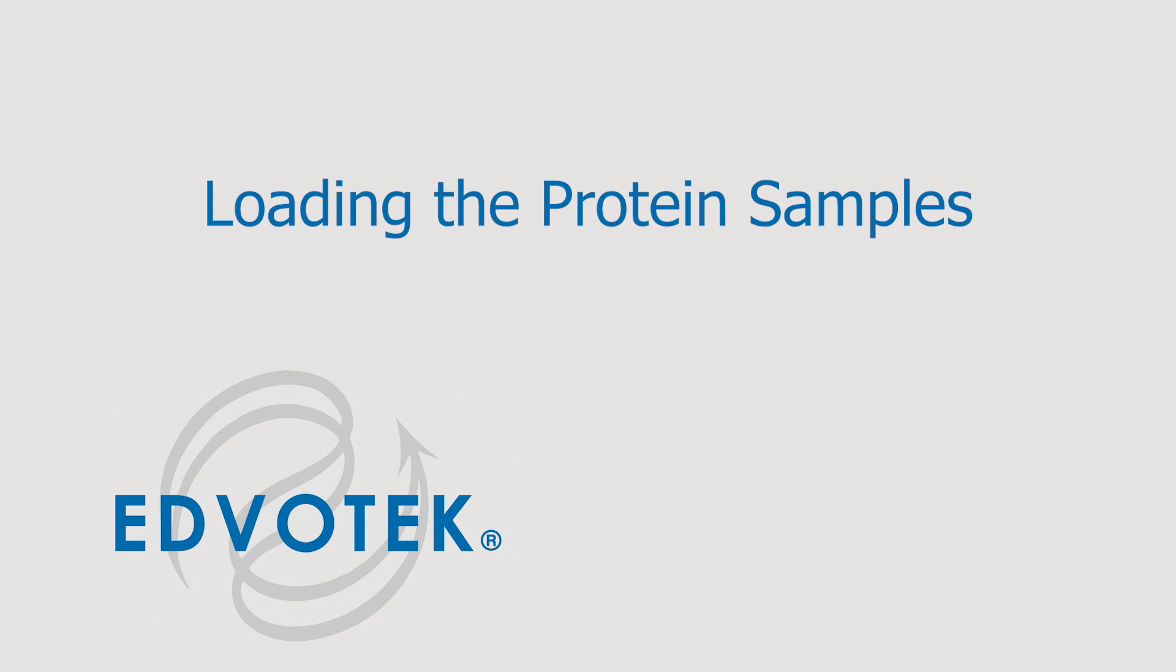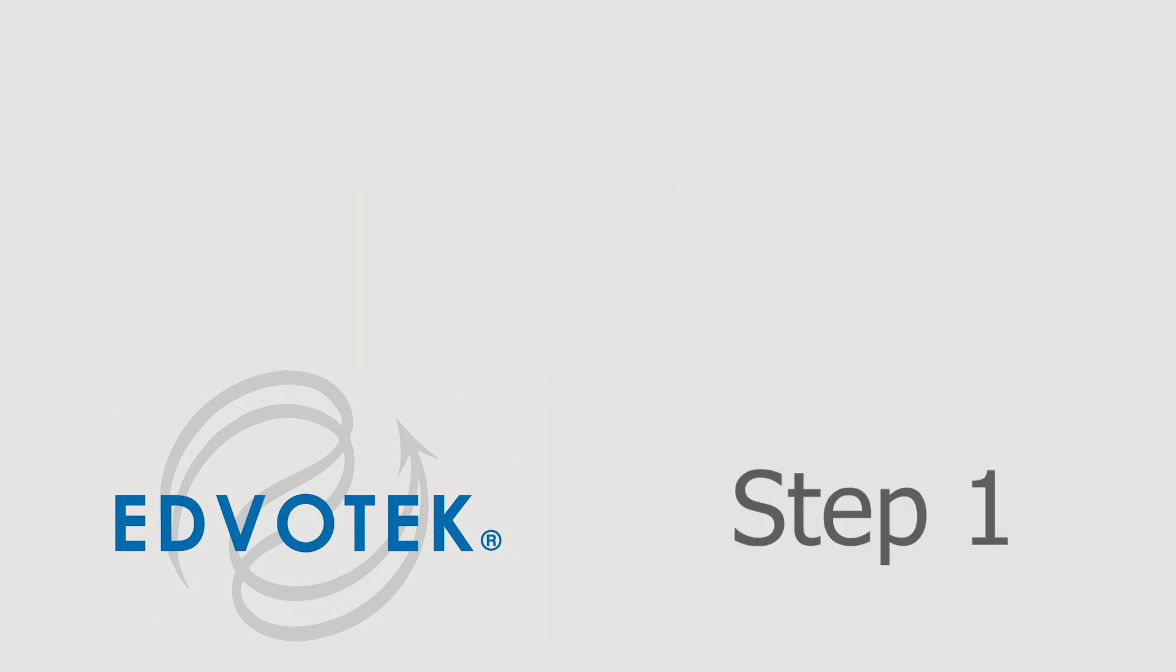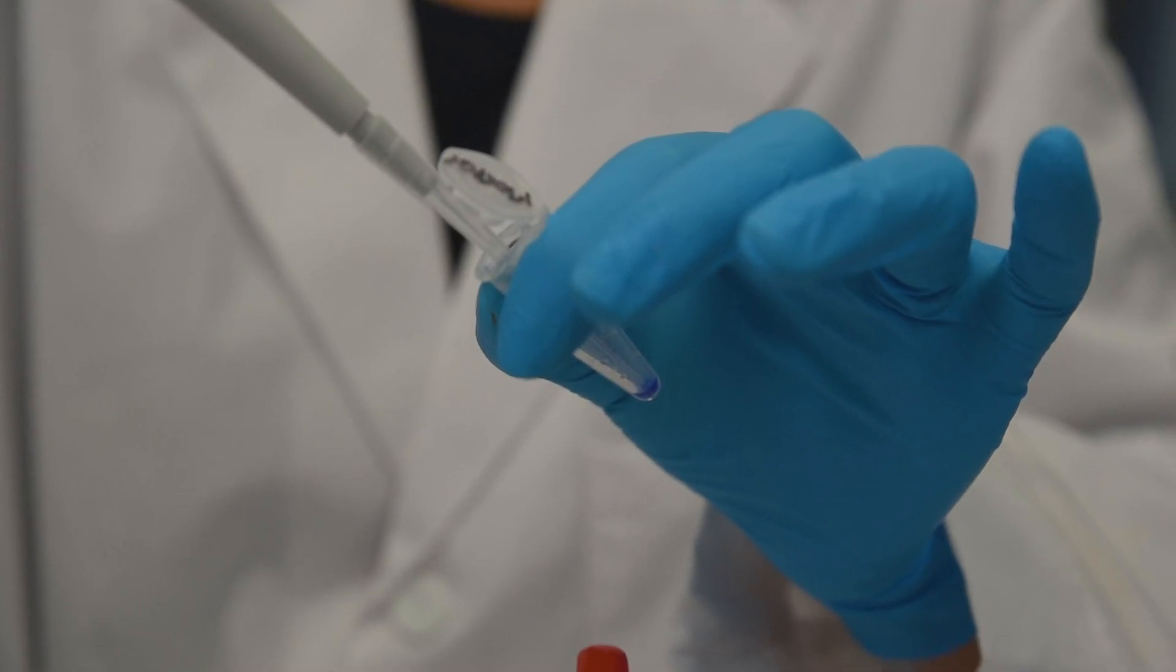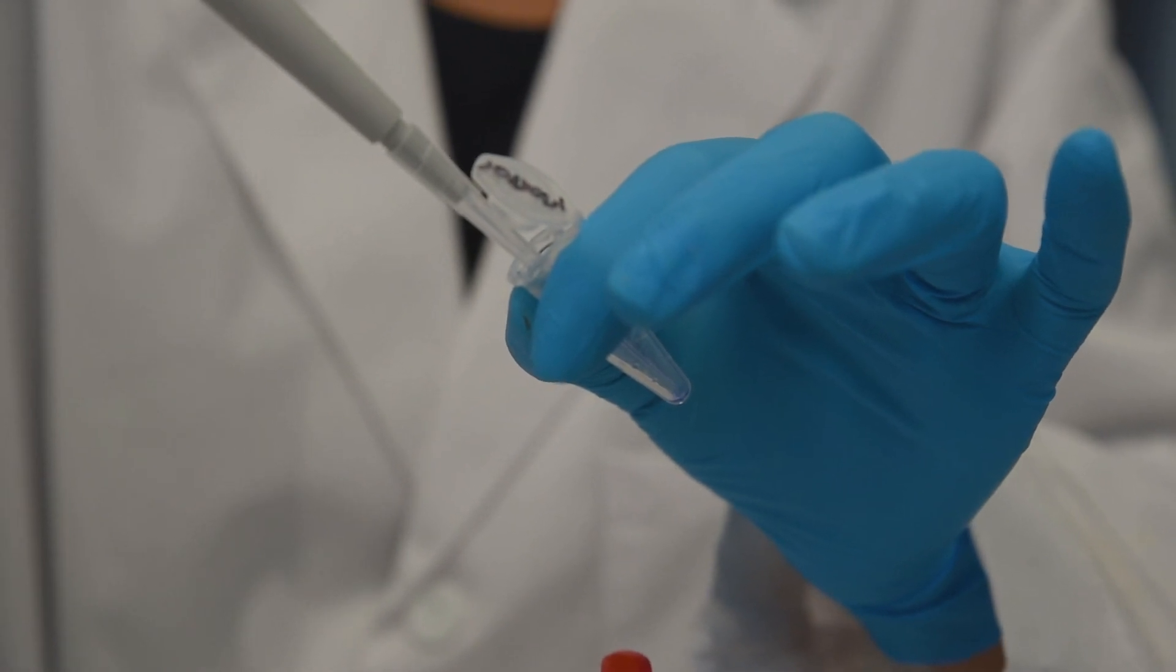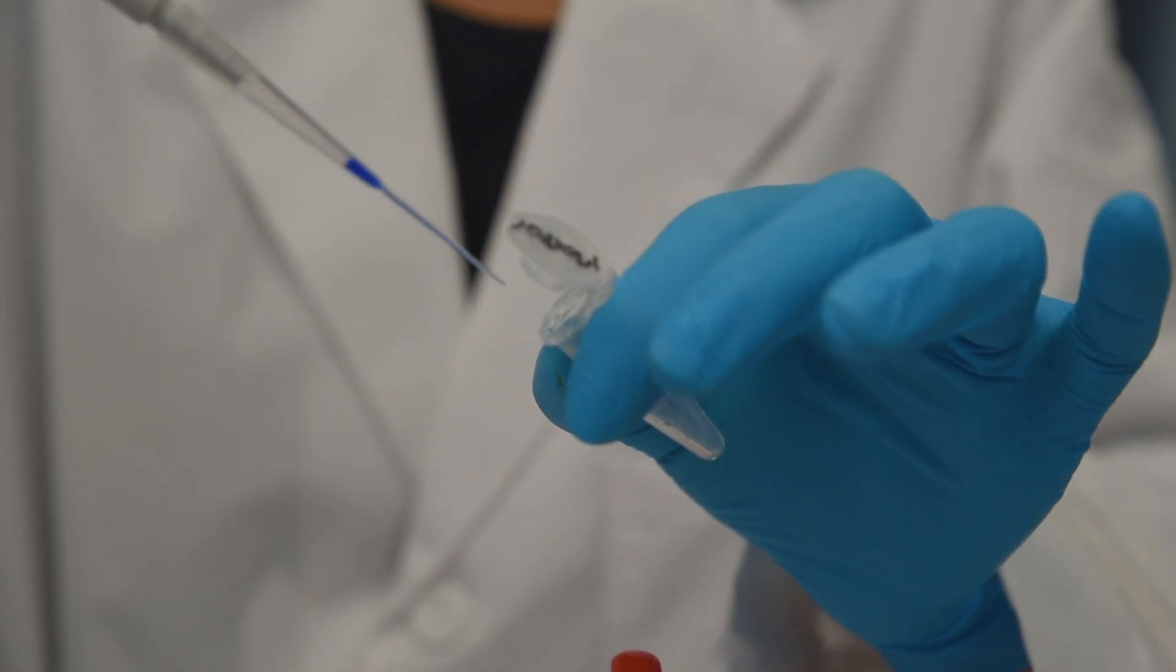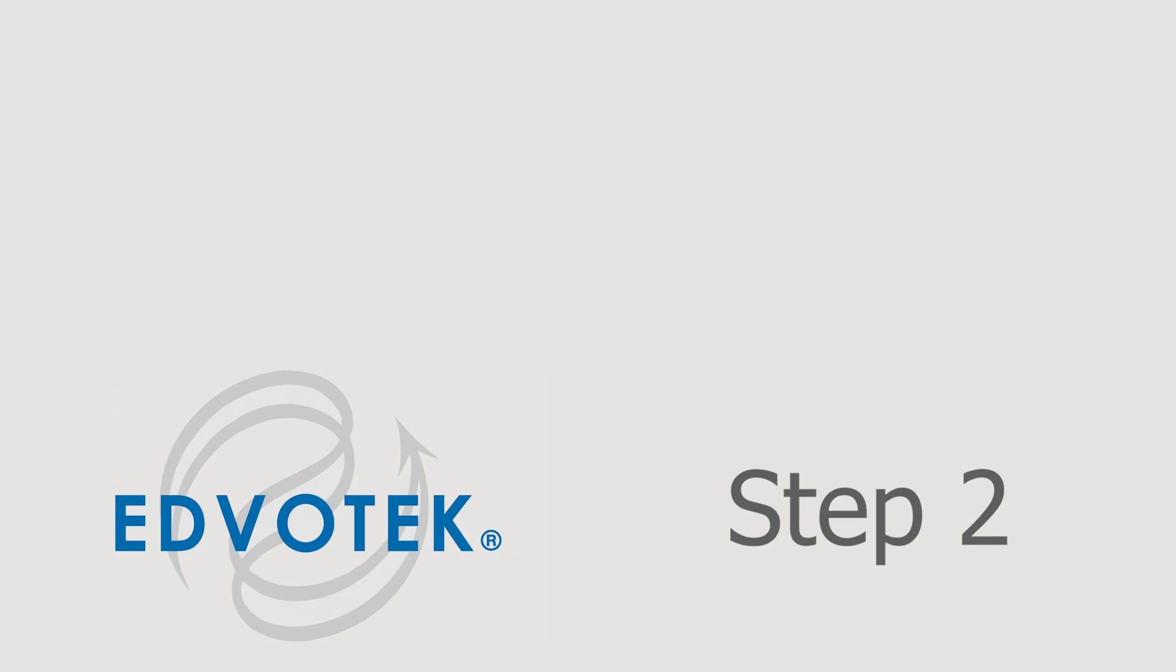Loading the protein samples. Step 1: Using a fine micropipette tip, measure 20 microliters of the first sample or standard protein marker. Step 2: Place the pipette tip under the buffer and directly above the sample well, resting gently against the back plate of the gel cassette.